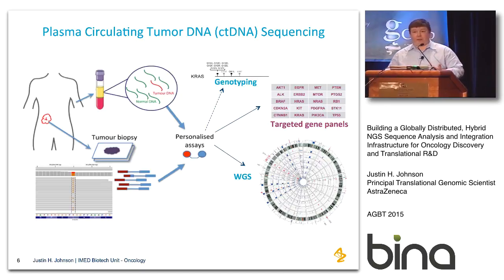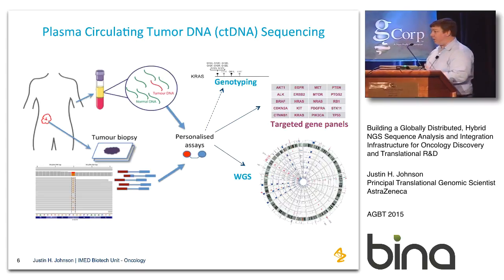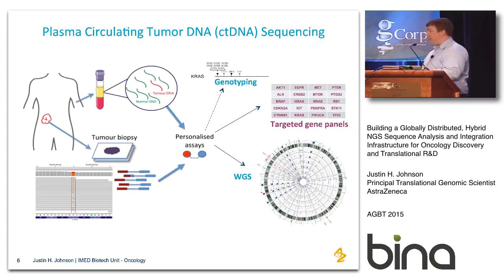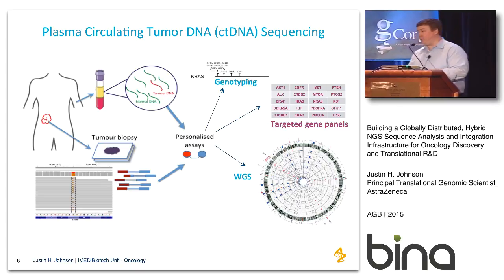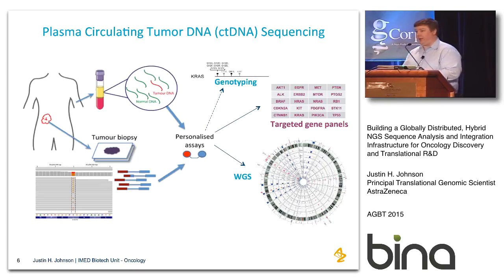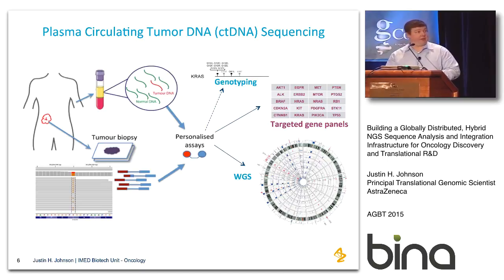So I don't think I have to beat this into the ground. This has gone over time and time again so far at this conference, this promise of the liquid biopsy. Some of the challenges of it are that the DNA is very fragmented, and there's very low copy number of the tumor cells within the plasma. So we started experimenting, amplifying what we call the key AZ cancer genes, amplifying these up and sequencing these out on PCR-based amplification platforms. And we were seeing really nice results here.